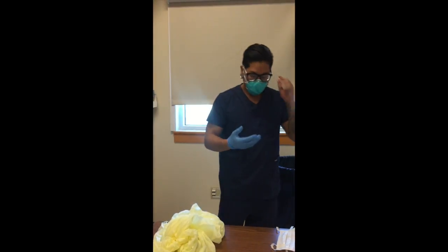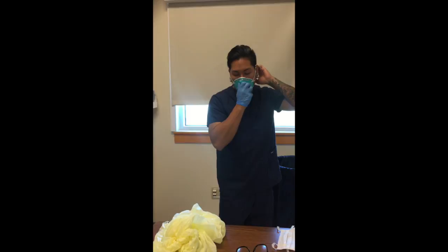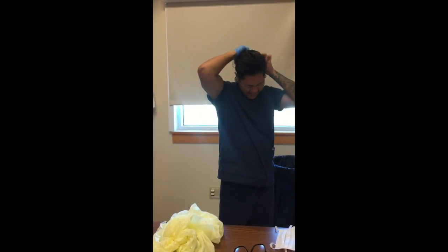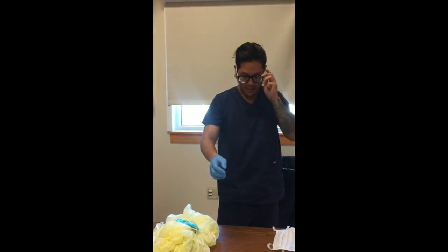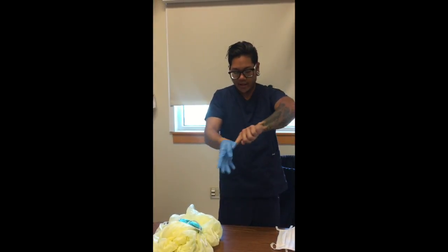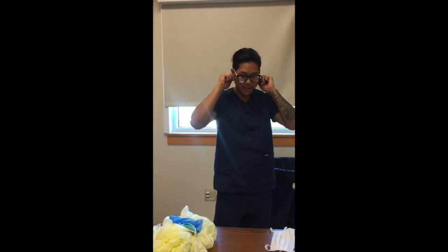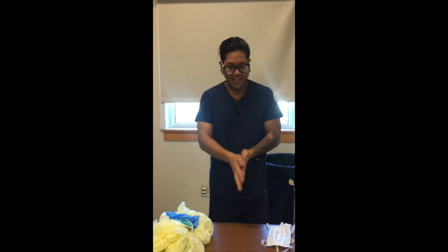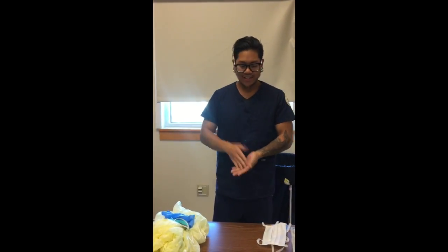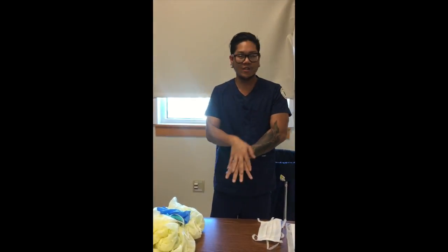Cool. And then I take my glasses off in the clean room. Grab it here. Pull it out. Okay. Then make sure you're not touching your contaminated areas, and then throw it away. After that, go back to the sink, and then wash your hands for 15 more seconds. I would say use hand sanitizer, but honestly, wash your hands because it's gross anyways. Just wash it 15-20 seconds, sing your birthday song, and then that's it. Walk out.